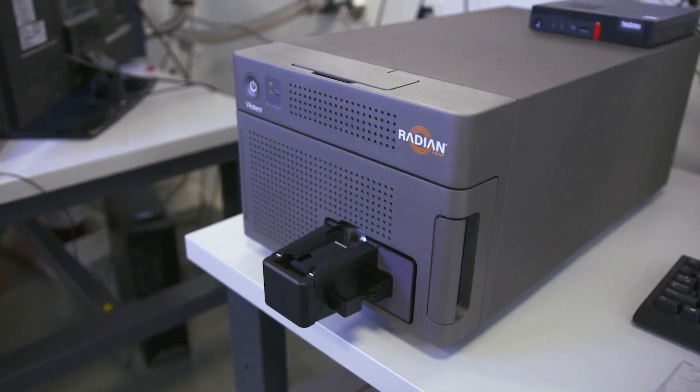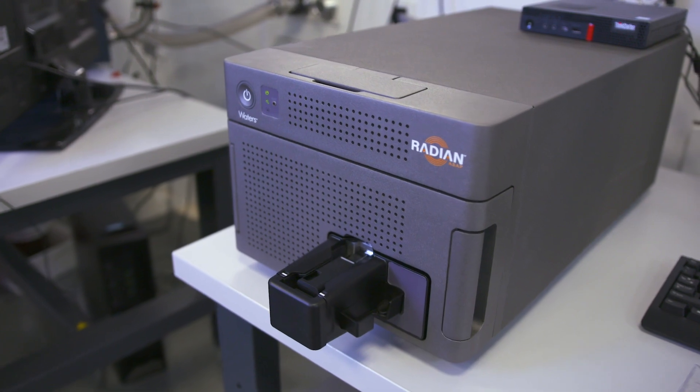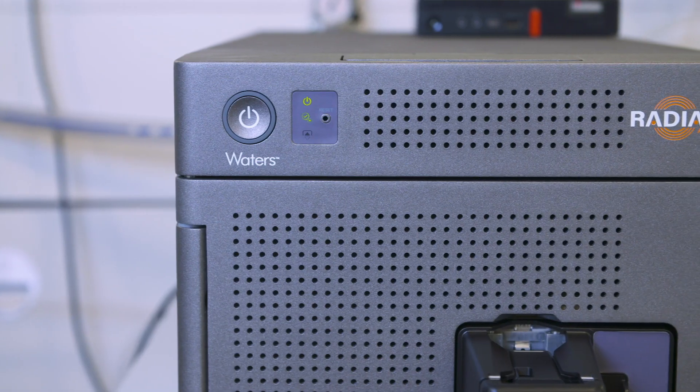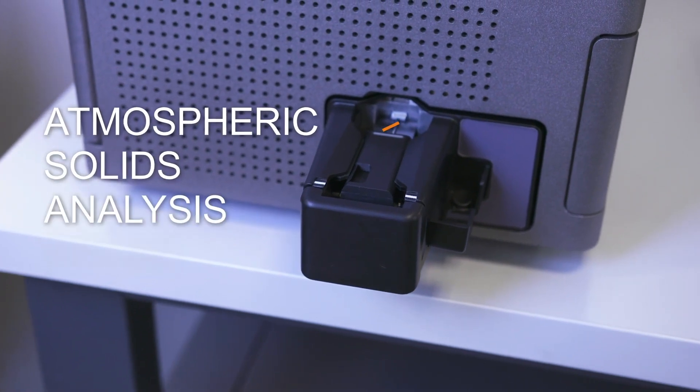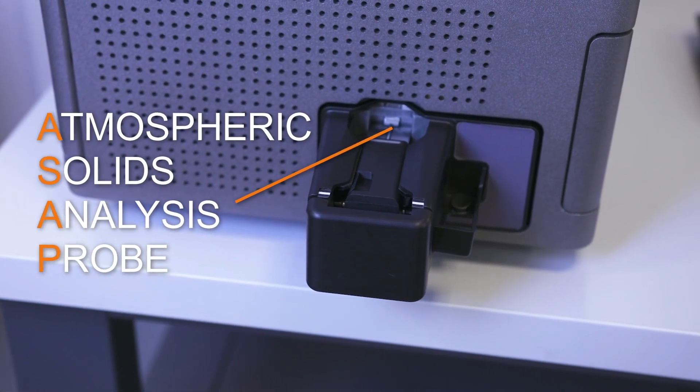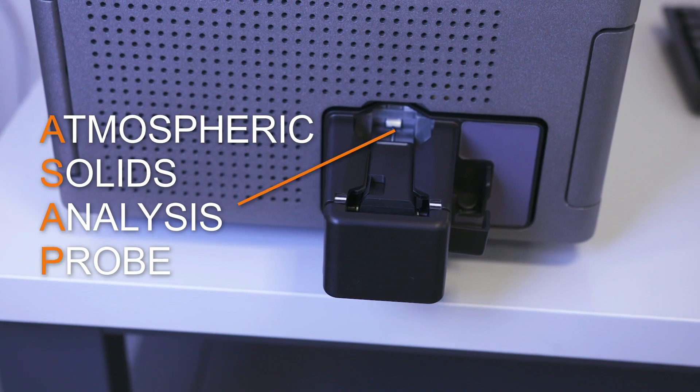The RADIAN ASAP instrument is a dedicated mass detection system with direct analysis utilizing the Atmospheric Solids Analysis Probe, known as ASAP, which can be used to address these challenges.